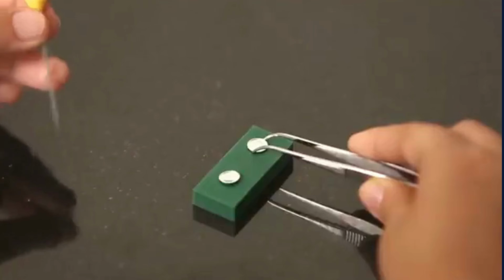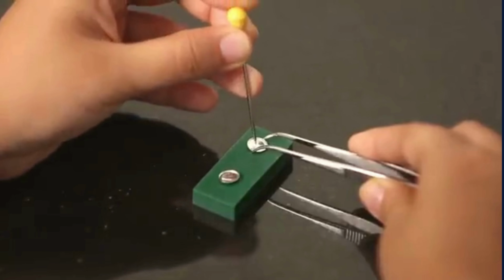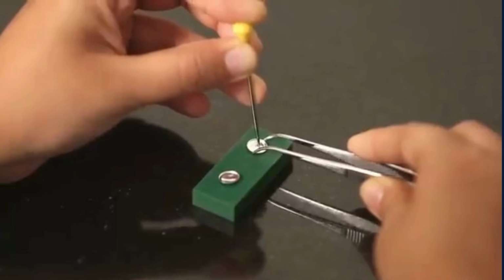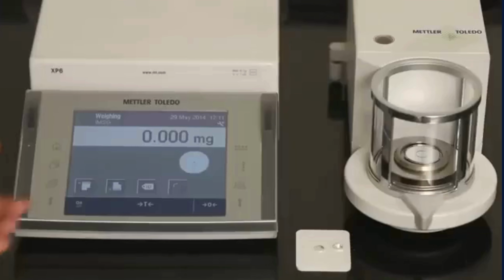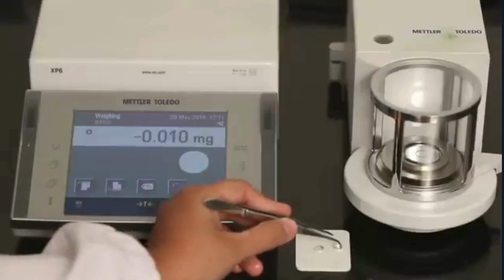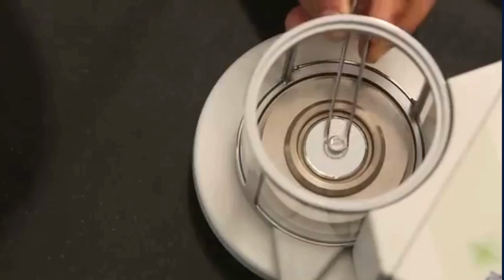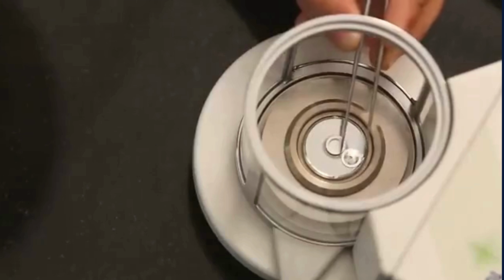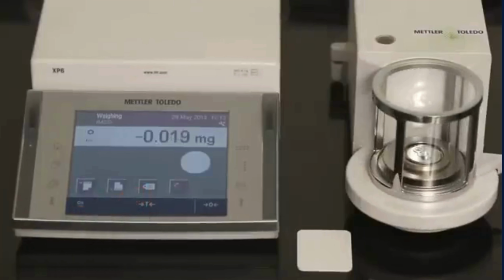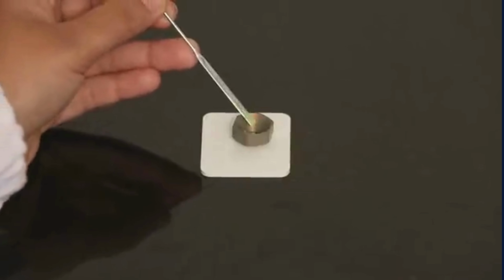Sample uniformity. Samples should be representative of the bulk material and free of contaminants, moisture, and dust. Powders should be finely divided and mixed thoroughly to ensure homogeneity. Pan selection. The choice of pan depends on the material and experimental objective. Standard aluminum pans for routine polymer analysis, hermetically sealed pans for volatile materials, high-pressure pans for curing reactions and decomposition studies, open pans for materials requiring gas exchange.